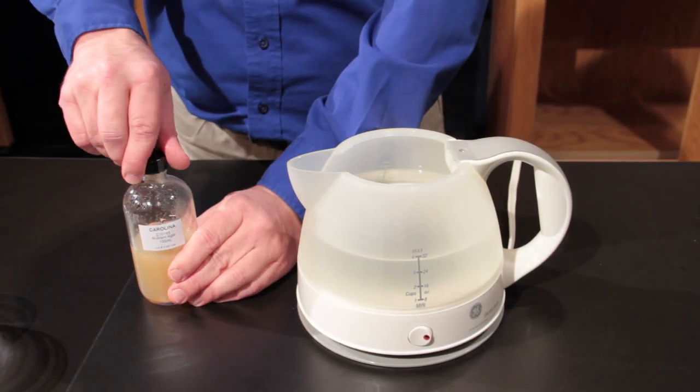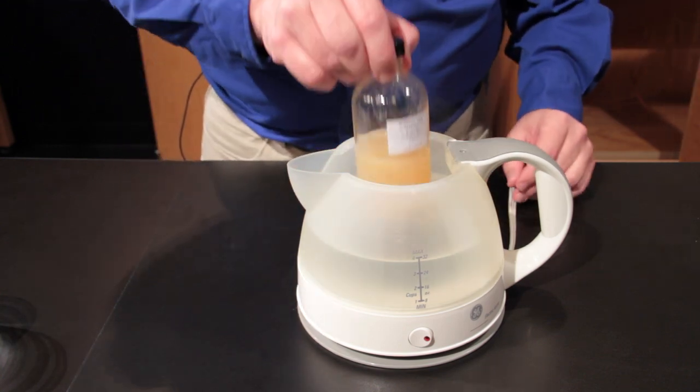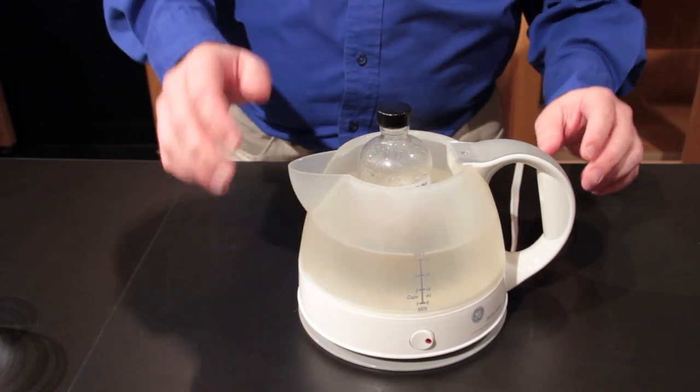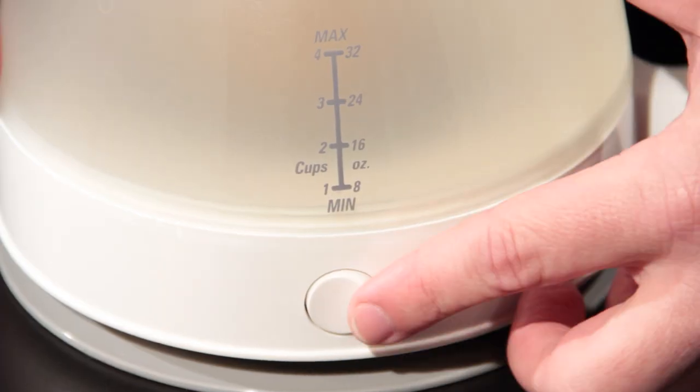Loosen the bottle cap but don't remove it. Set the bottle in the pot and check the water level. The water level should be slightly above the agar. Now you can begin to heat the water.